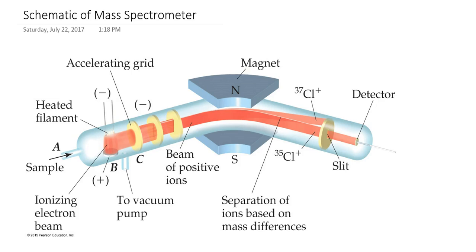do that, you have to obtain a sample of the compound or the element, and you have to introduce it into an instrument like the one shown in the schematic below. Now, mass spectrometers actually now come in a wide range of varieties. They don't all operate on the same principle. However, this is a fairly common type of mass spectrometer that we call a magnetic sector mass spectrometer. And I'll just briefly explain the way that these types of instruments work.